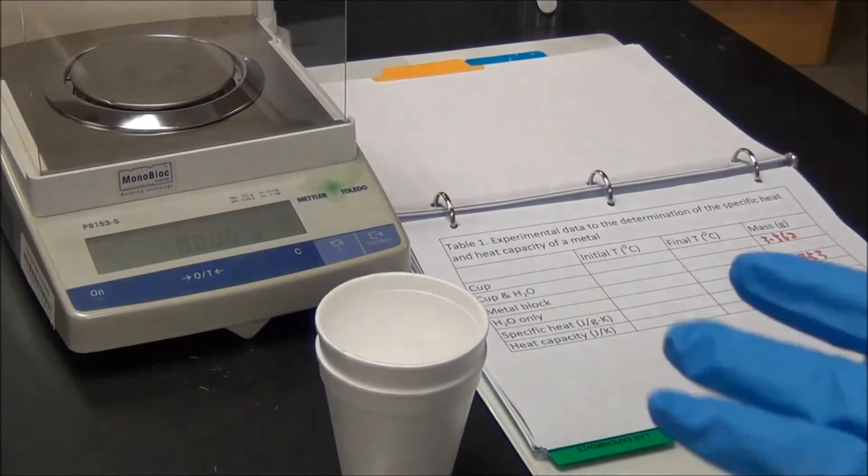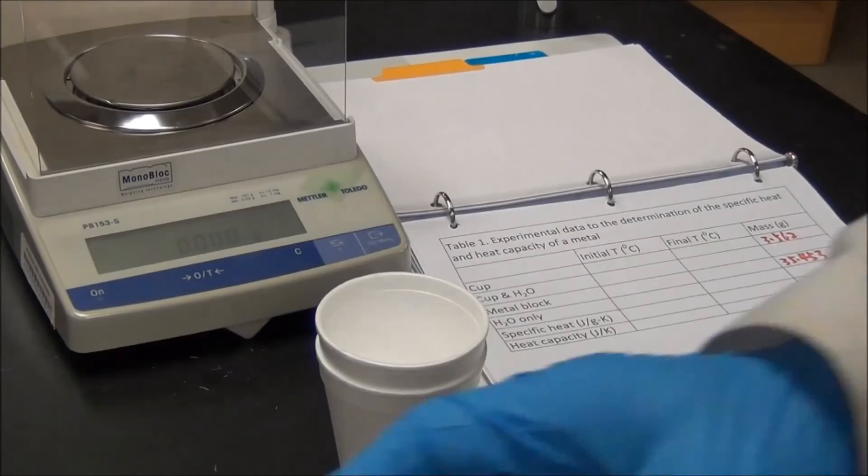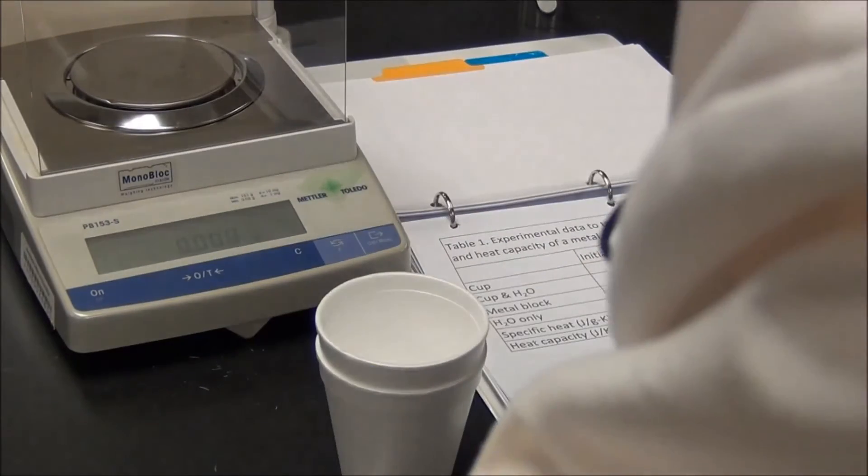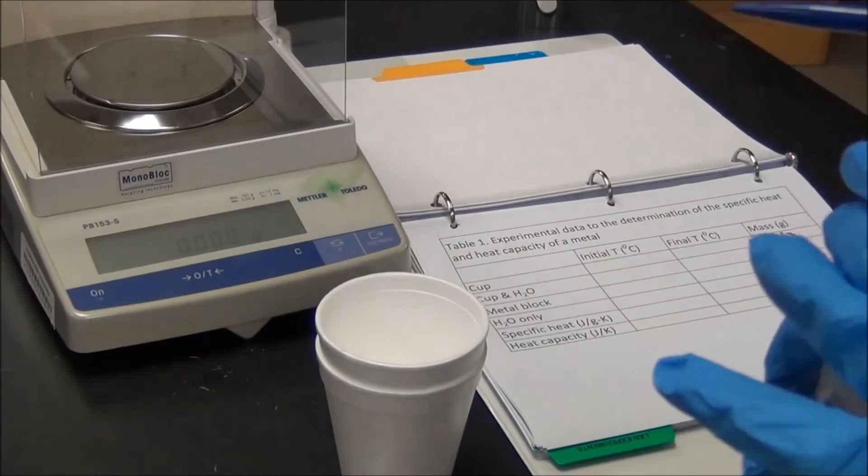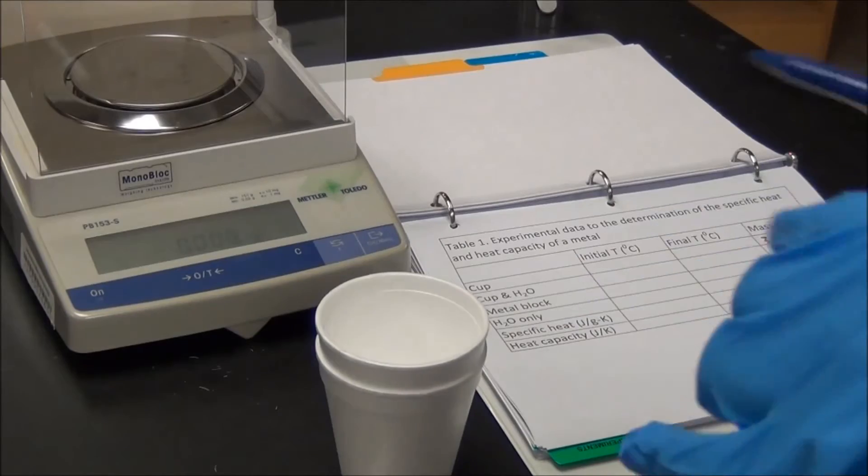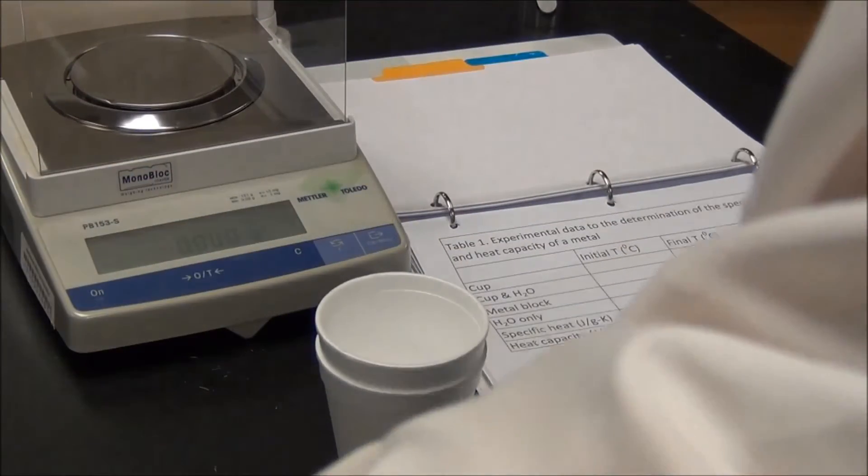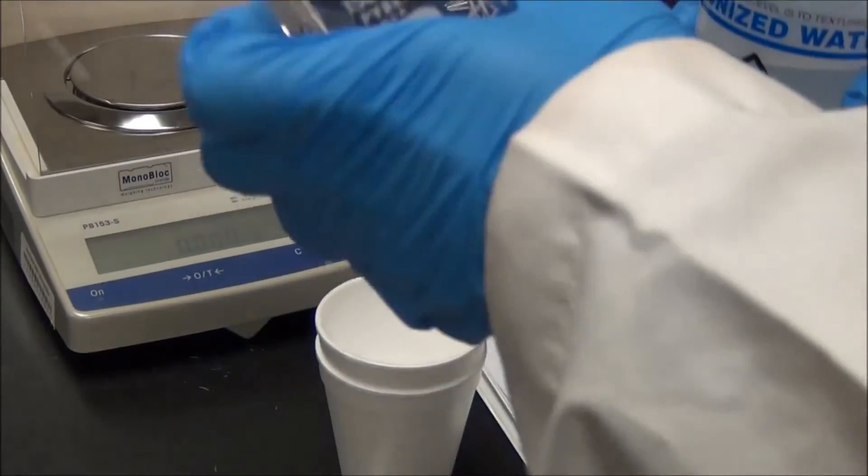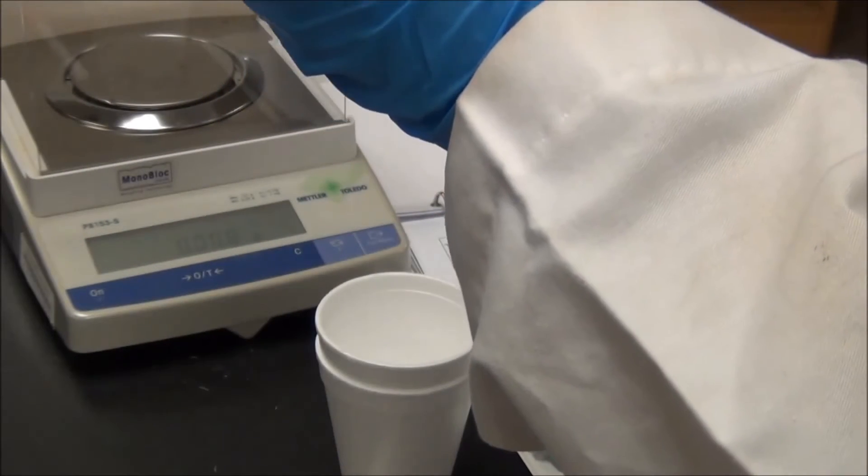And then we need to add about 30 milliliters of water into the calorimeter. Because this does not need to be exact, so we just use this cup to take our measurement.